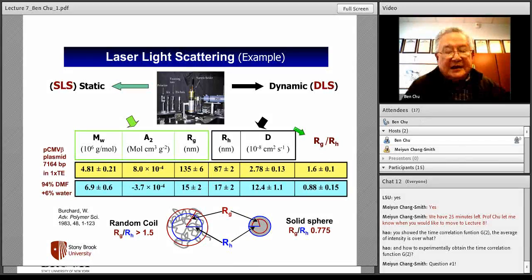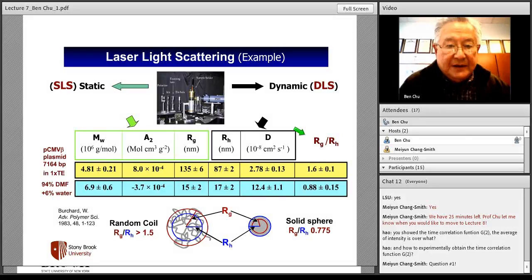Now, one student asked about biological systems, how far do you go? Well, you buy a commercial instrument, or in reality, of course, you can think about using different lasers of different power, using the blue, the red, the near infrared, but very often it's limited by other restrictions. The restriction being, suppose your biological molecules don't like ultraviolet light, and if the intensity becomes too high, they get decomposed. Then what are you going to do?